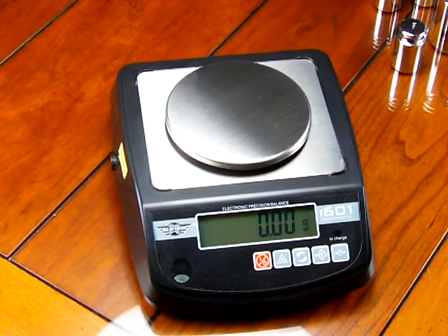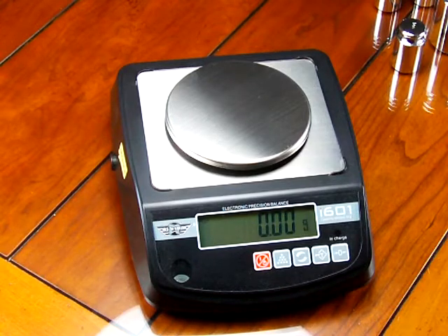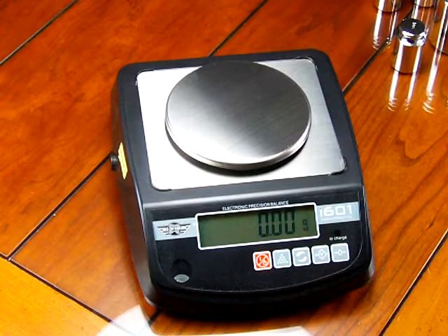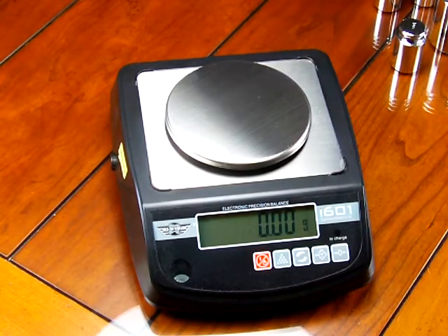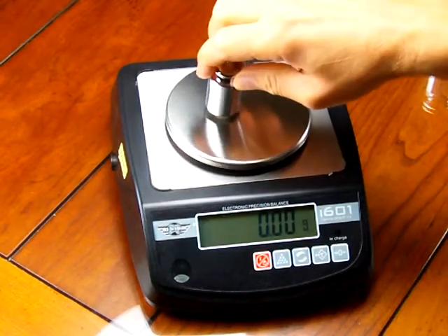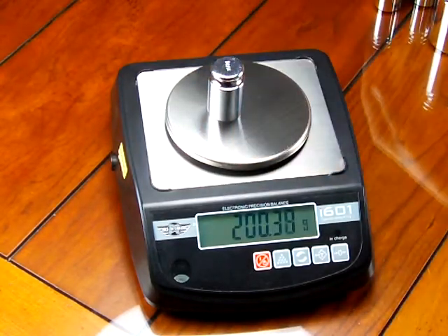So the i601 offers 600 grams by .01 gram readability, so it's a two decimal place balance and you'll notice when we put these calibration weights on.